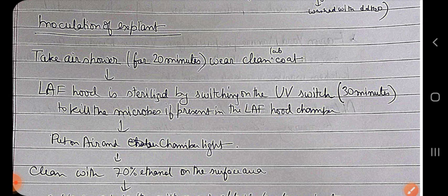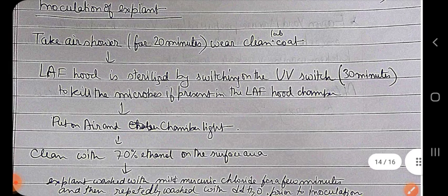We have to take fresh air, and the clothes that we are wearing should be neat and clean. A clean lab coat should be used. Not even the lab coat which has been used for the previous experiment. A clean lab coat is required. At least for 20 minutes we have to take an air shower. And then we have to sterilize the laminar airflow, because previously some students or researchers have used that laminar airflow, so it has to be sterilized.